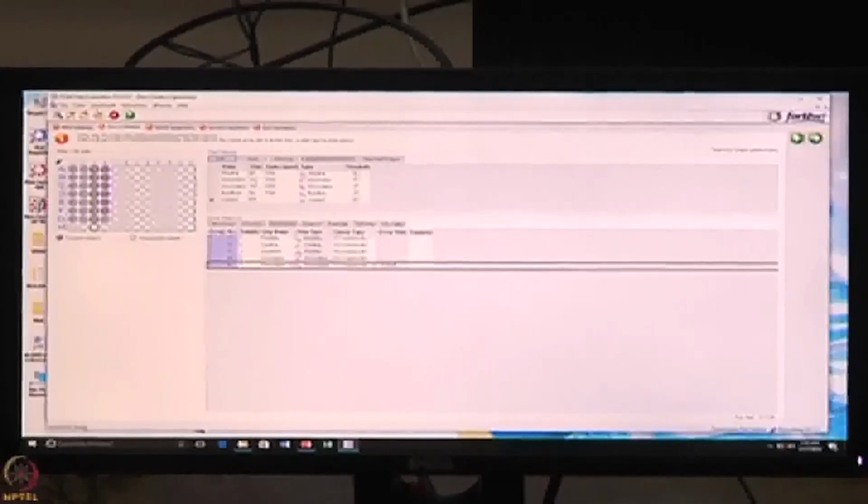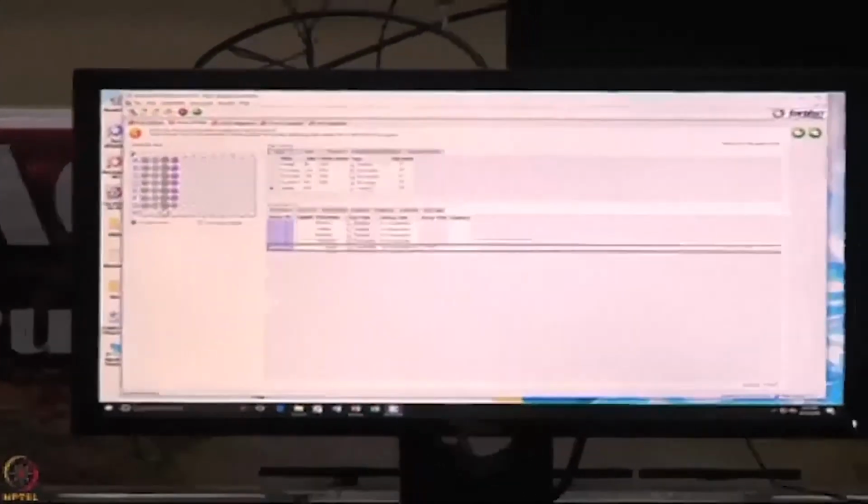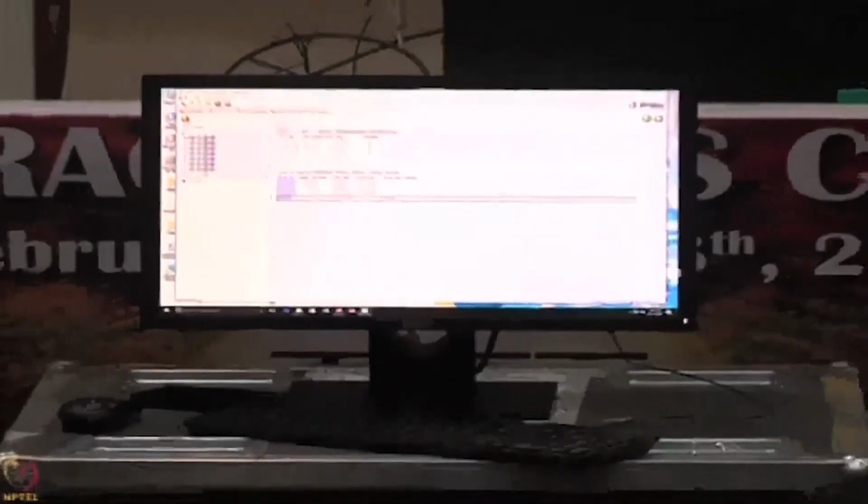These SPR experiments have to be set based on the experience you have. It's not fixed. The general assumption is that the minimum is 300 seconds or 200 seconds. So I have put 300 seconds.